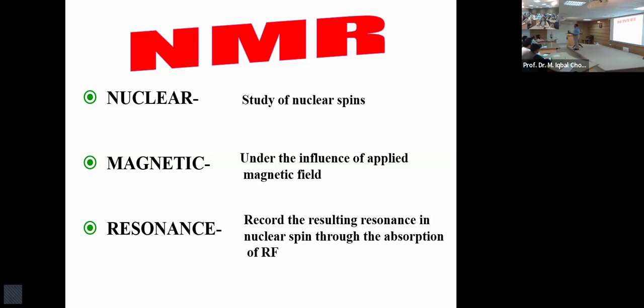On top of it, NMR is a very insensitive technique, and detecting such a small signal from a very insensitive technique was an impediment also. Then development of a magnet, which can create the stage for the absorption of radio frequency, was an impediment. So there were two kinds of impediment.